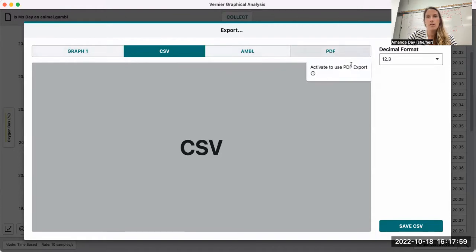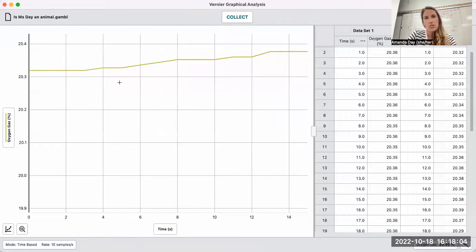And then that's it. Most of the analysis we're going to do is going to be copying and pasting the data from our data sets and then taking screenshots or saving these graphs.